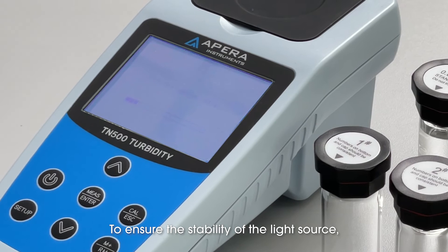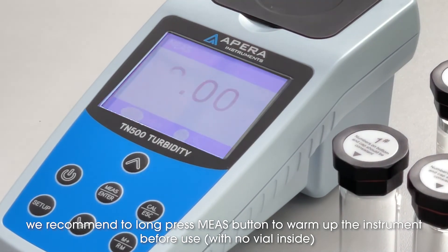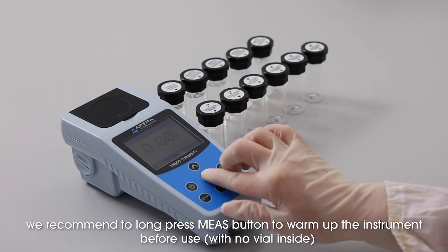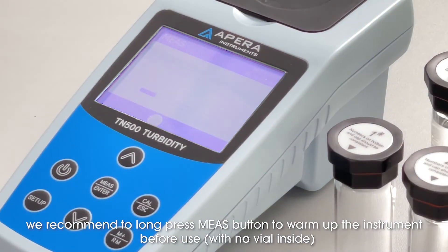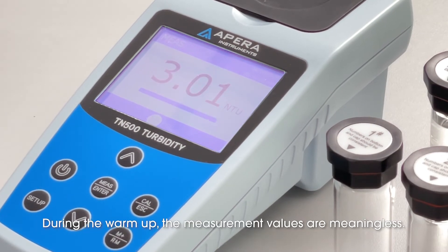To ensure the stability of the light source, we recommend long pressing the measure button to warm up the instrument before use, with no vial inside. During the warm-up, the measurement values are meaningless.